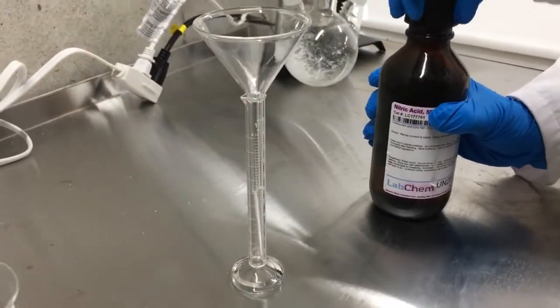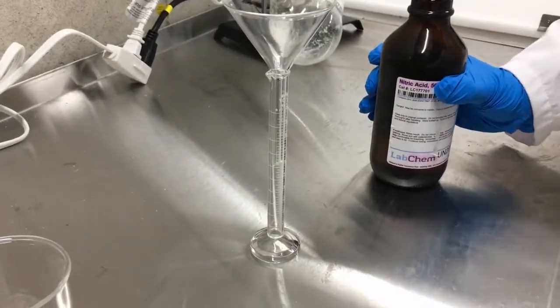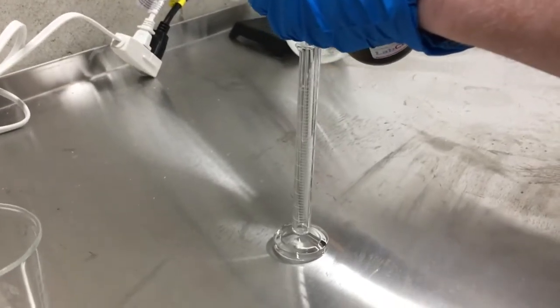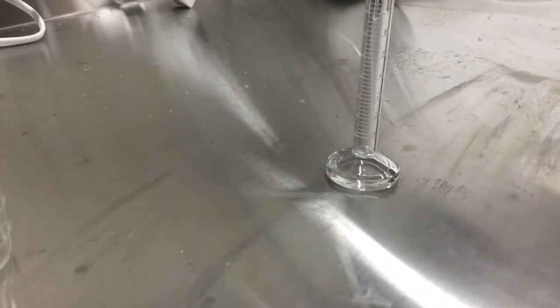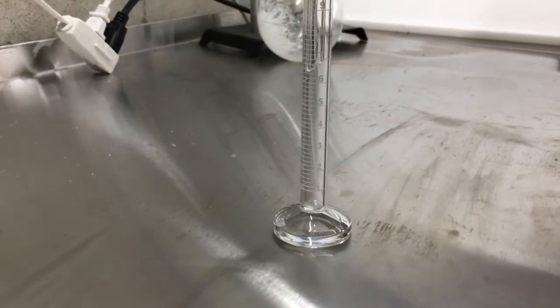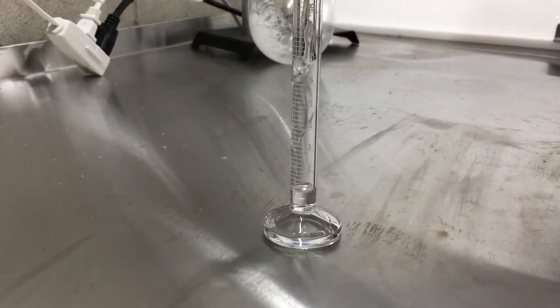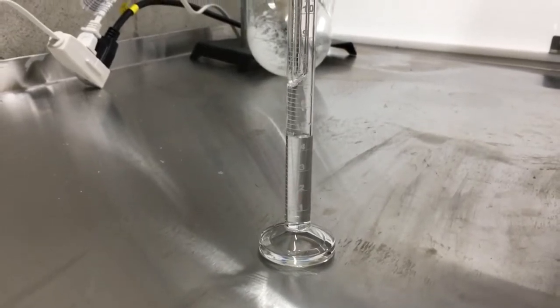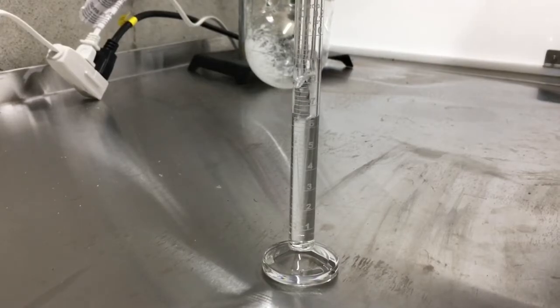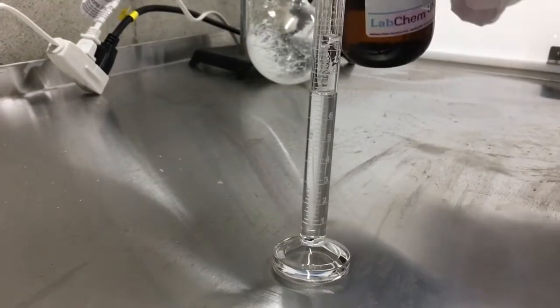So the next obvious reactant for silver nitrate is nitric acid. For the 2 grams of silver shavings I had, about 7 milliliters of 50% nitric acid should be the correct amount. When reacting metals with nitric acid, a high amount of water is needed to dissolve the nitrate salt that forms against the metal, or else the nitric acid will have no way to reach the metal and the reaction will come to a halt.